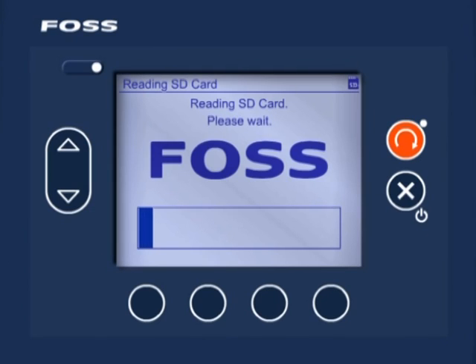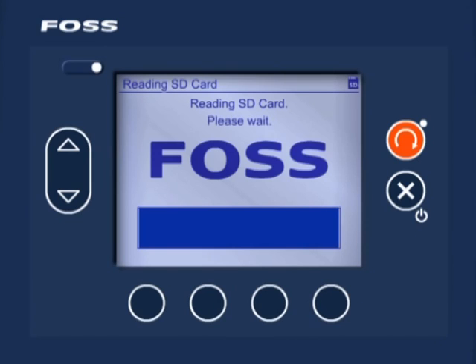When the instrument has completed reading the SD card, if a software upgrade is available, the instrument will indicate the version of the new software and prompt you to press the soft key OK to install it. Once the software upgrade has been installed, the instrument will automatically restart. Any updated instrument settings, changes or additions to the list of available products will also be installed.